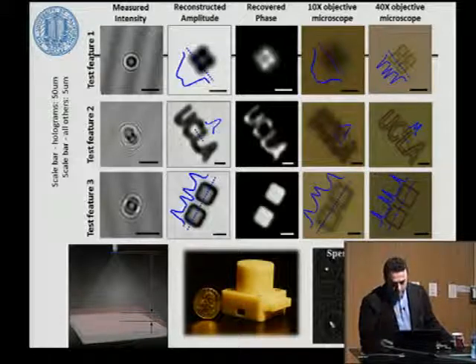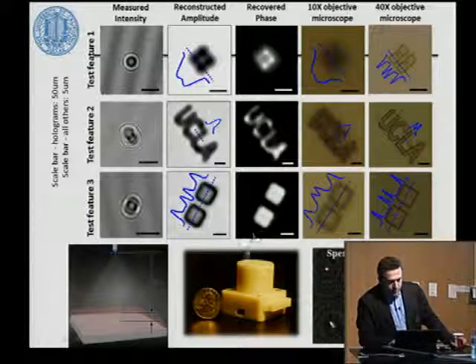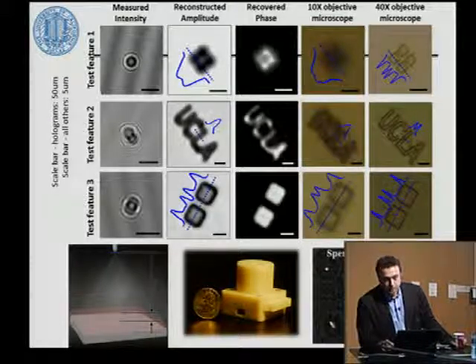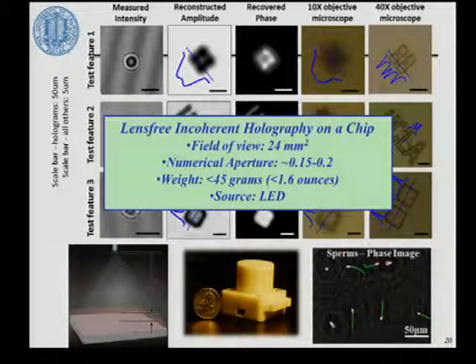chip design or fabrication. In this simple form, you're looking at a very lightweight design, about 40 grams in this case. And the resolution here is dictated by the pixelation. In this unit magnification geometry, one major advantage that we have is the field of view. 1x geometry is beautiful because the active area, that half centimeter by half a centimeter active area, is my object field of view. In this case, it's about 24 millimeters square.